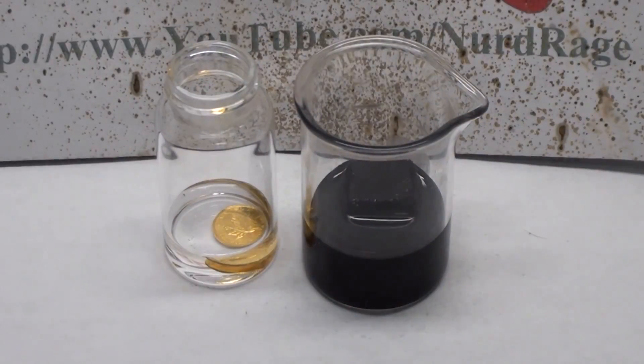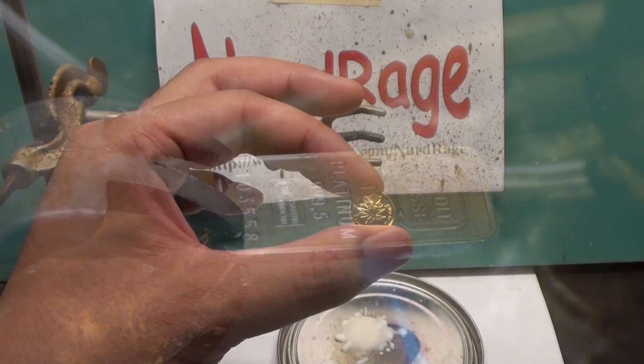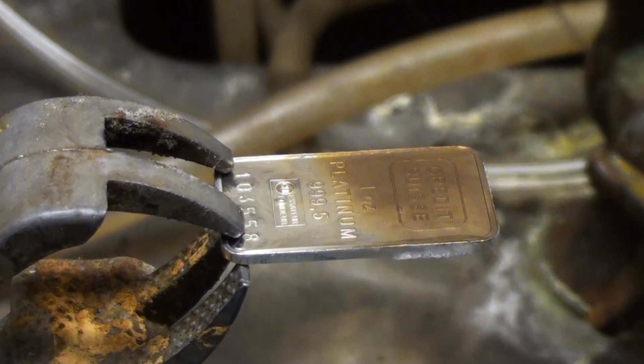In a previous video we examined the chemical resistance of gold. In this video we're going to examine the chemical resistance of platinum.